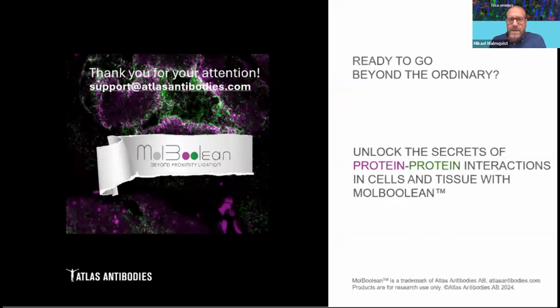Next question then. Could you comment on the scenarios where it would be beneficial to use MolBoolean over other proximity assays? I think there's always, Mickey brought this up a bit, if you have a situation where you have a change in protein abundance, then of course if you're using another proximity method, you will see the decrease or increase in protein interaction that might just reflect the abundance of the two different proteins.